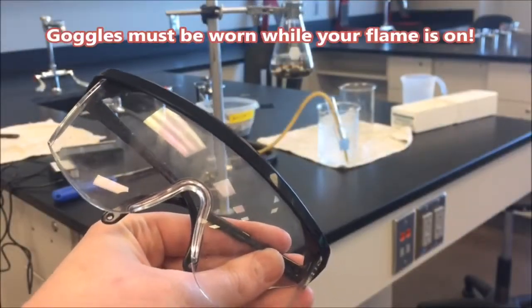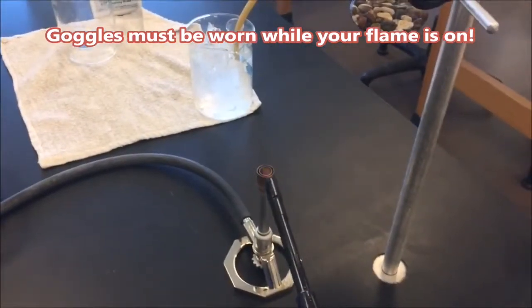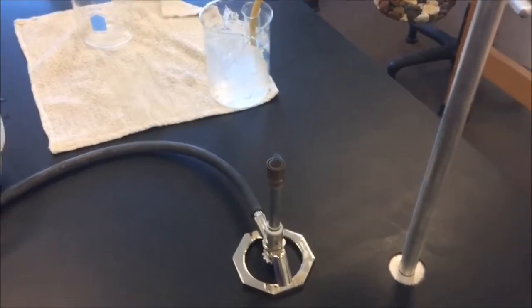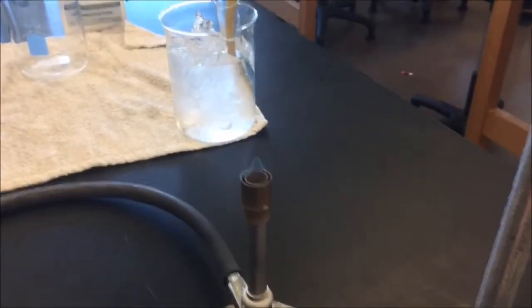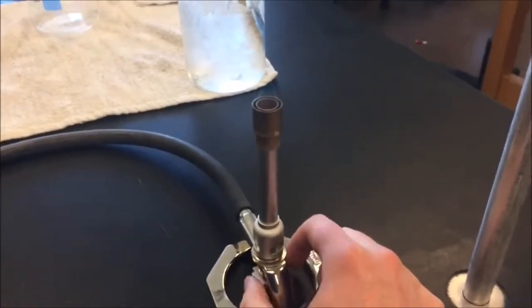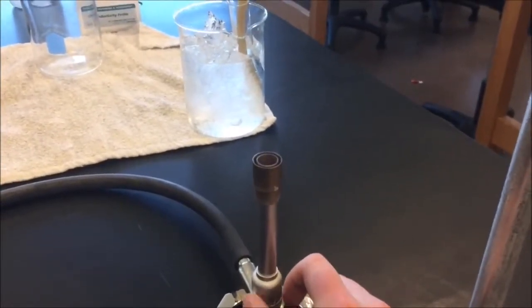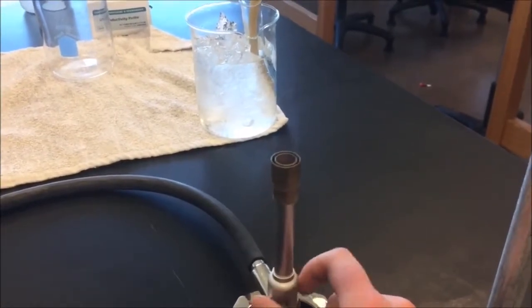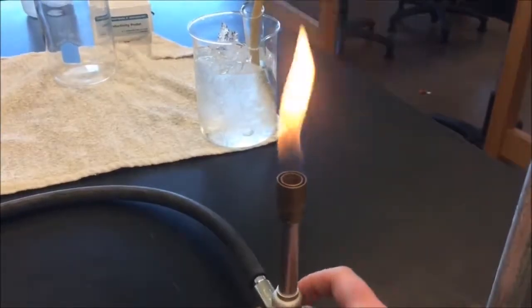When you're ready to start the Bunsen burner, make sure to put on your nifty goggles. So let's light the Bunsen burner. You're going to want a nice blue flame within a flame that kind of looks like this. You can adjust the bottom of the Bunsen burner to increase or decrease the amount of gas that's coming out of the Bunsen burner. And you can move this to change the temperature of your flame.